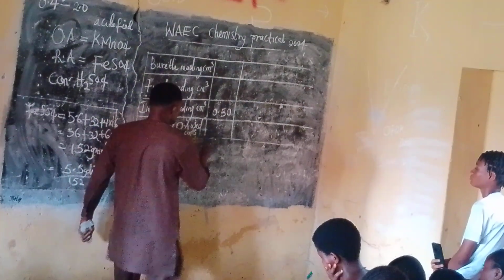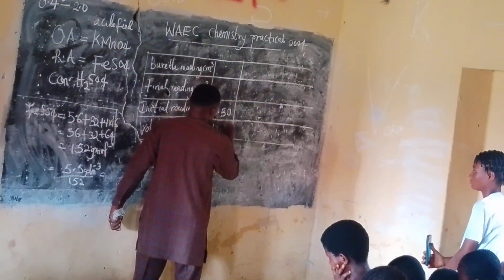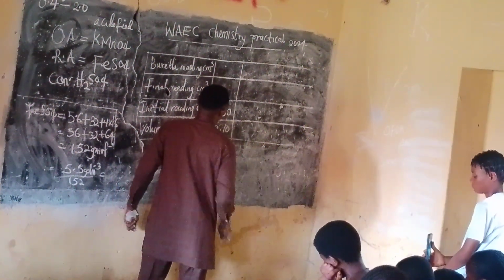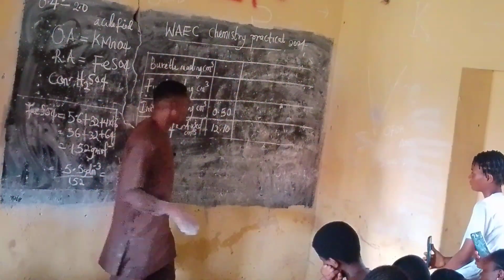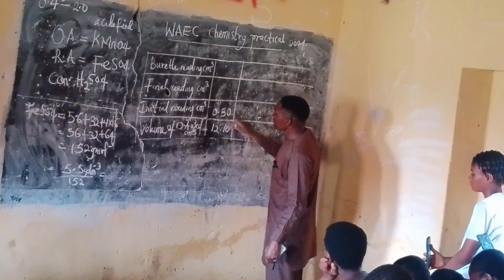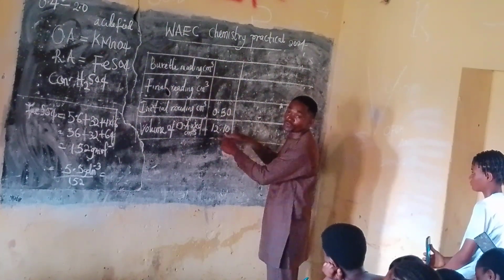So that is the value that you will get here, 12.10, as my rough, because rough is not usually accurate. Are you with me? I've created that rough. Then add these two together. This is where I started initially. I've created a rough by adding 0.4. Are you with me?